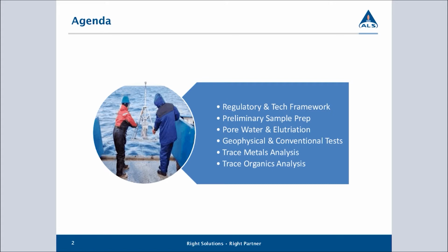Agenda. Here, we'll just go over a little bit of some regulatory and technical frameworks. We'll talk about the all-important procedures of sample prep, and a little bit about pore water, geophysical and conventional tests, and then on to some trace metals and trace organics. These are all going to be a very brief overview, so we're not going to take a tremendous amount of time in going in depth on a lot of this.